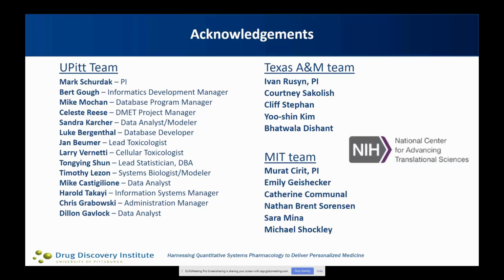In terms of LINCS, the main focus is generation and sharing of data, right? All the LINCS data is publicly available pretty much upon generation, and one of our objectives is to push it out to the community as fast as possible and in as many different ways as possible, so that it can be used by the community. So it's slightly different, I think, in focus in this sense.